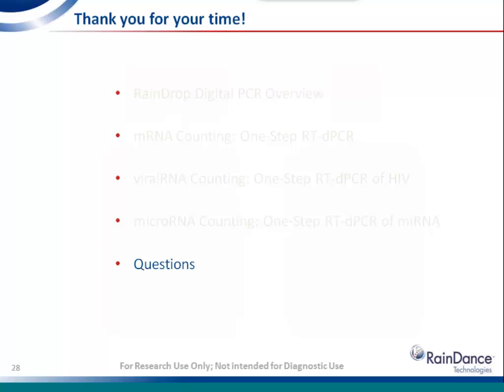A couple of runs, really all you're trying to do is add the 2 different probes for, let's say, target number 6 at the concentration so that at endpoint it's going to show up on that scatter plot in a distinct cluster. The software provided with the RainDrop system essentially takes those scatter plots, the raw data, and you can draw any gate around any spot on that scatter plot that you want, and the software will just immediately tell you how many molecules are present inside that gate. So as long as the clusters are separable enough to draw clean gates, you can continue to multiplex.